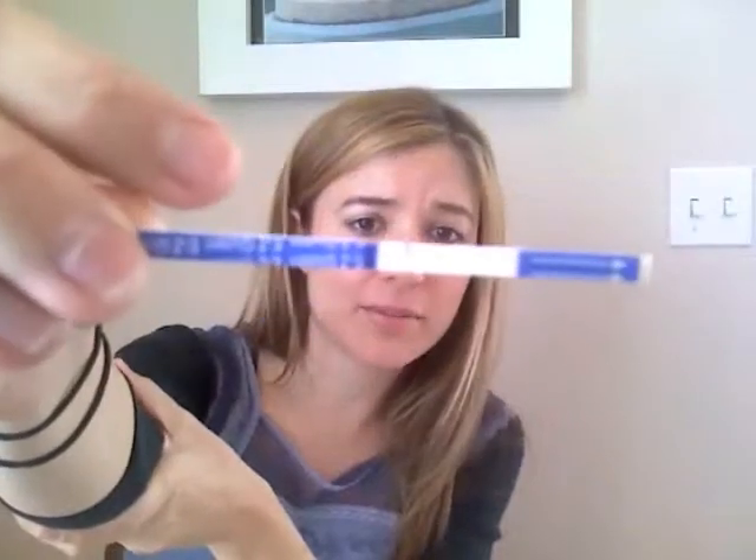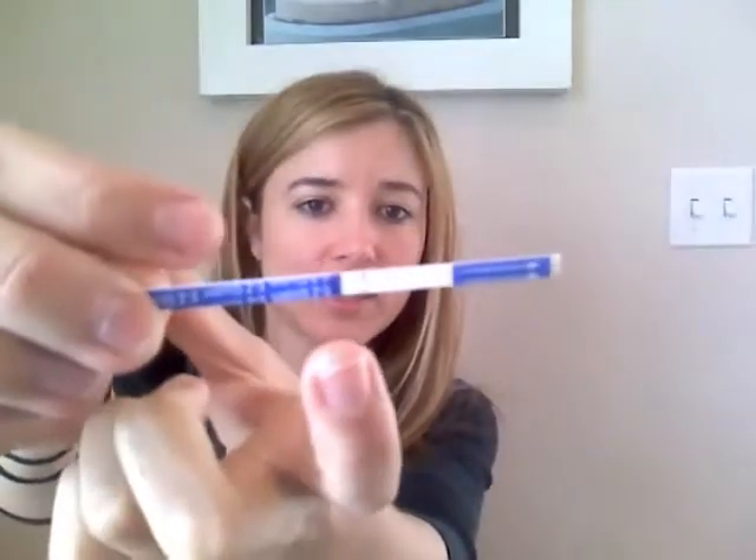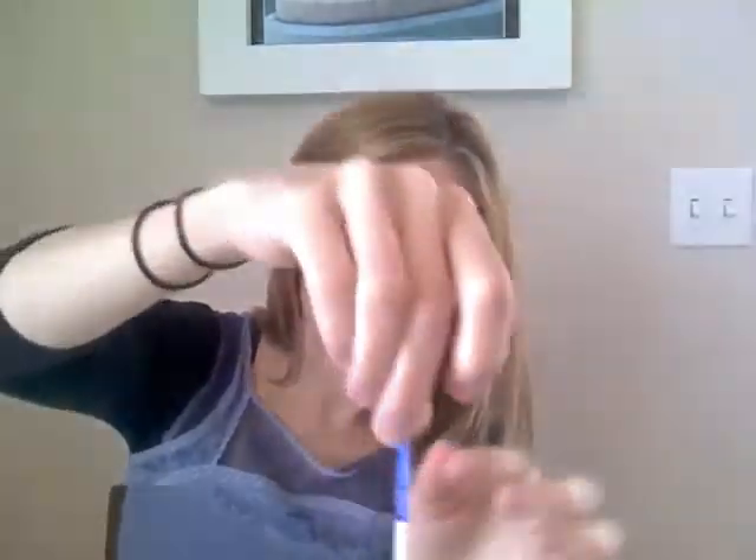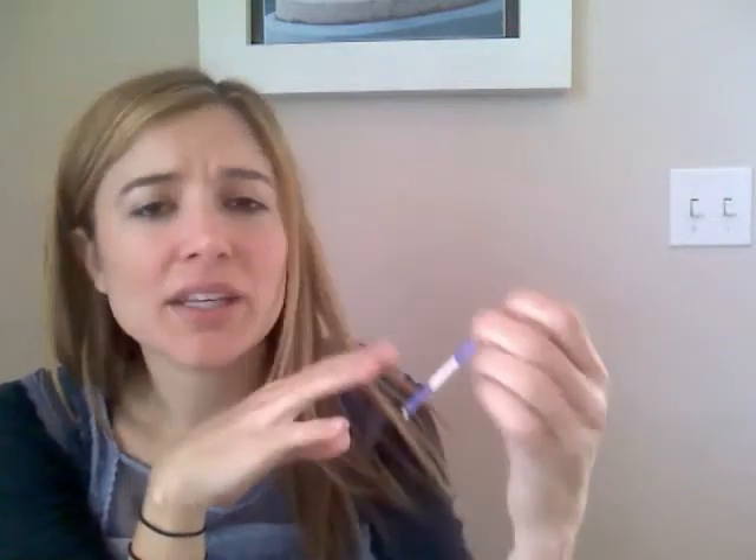Well, the results are in, sort of. This is the first time this has actually happened to me, but I'm not certain of these results. If you can see, we have a very clear top line, although one half of it is a bit blurry. We have a very clear top line. The middle line is kind of half there, half not. And the bottom line — I can see where it should be, but I'm not sure if there's a bottom line or not. So this is between a negative and a positive. I'm really not certain of what this means.